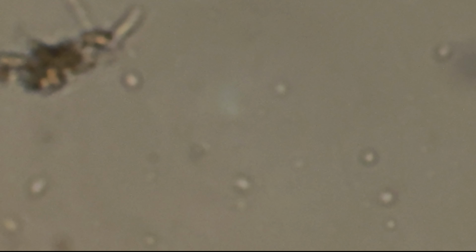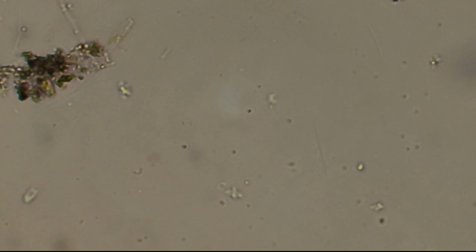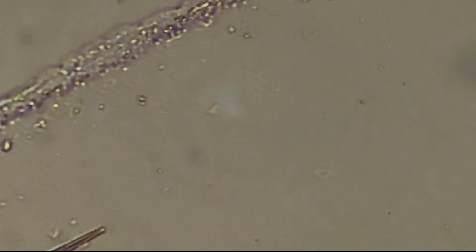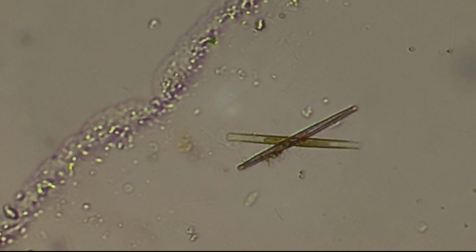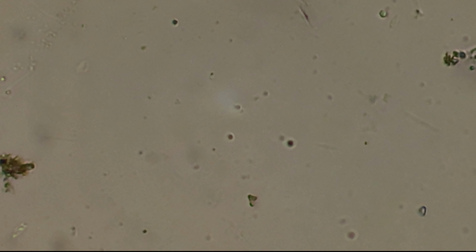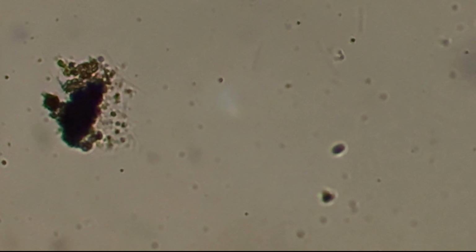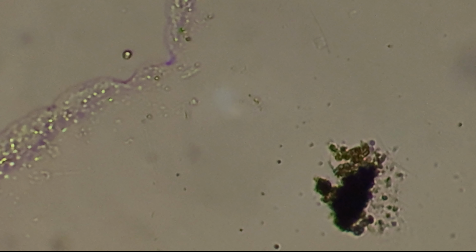So here's where we are. Most of the movement across this slide has stopped. A few organisms near the edges, in areas where the kiwi juice hasn't fully spread, are still going. And based on everything we just talked about, the acidity, the enzyme, the osmotic stress, the sudden environmental shift, any one of those, or some combination of all of them, is likely responsible for what we're seeing.